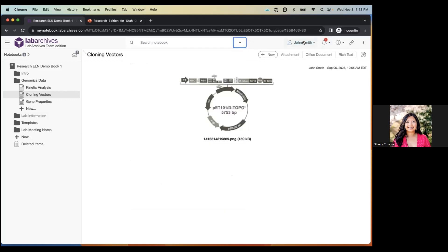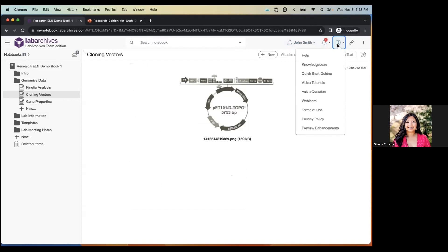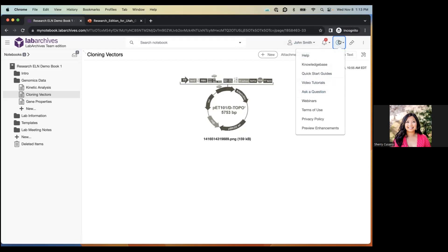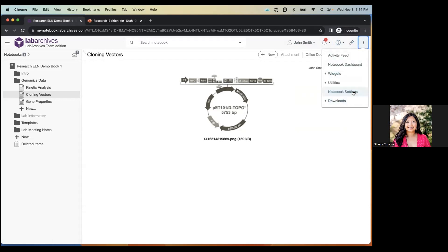To the right of the search box is the user icon for accessing user properties. Next to that is the notifications icon, which we'll cover later. The eye icon is the help icon — clicking it lets you access the knowledge base, quick start guides, video tutorials, or contact support. There's also an inventory icon that will start an inventory lab, bring you to your existing inventory lab, or let you toggle between multiple labs.